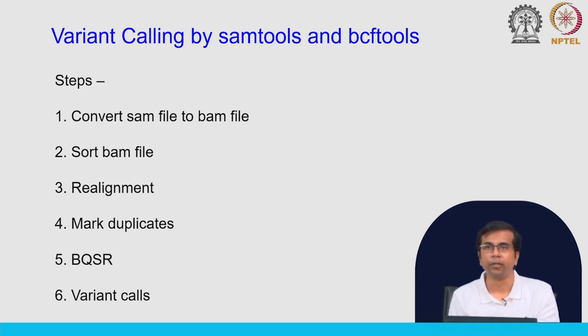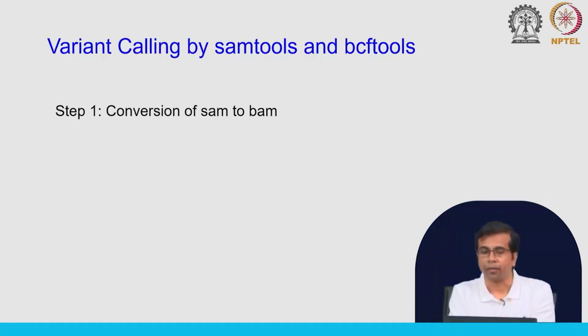Okay. So, one of the things you should notice is that when we install SAM tools, etc., you might end up with some issues with some libraries. Okay. So, you would have to install them independently. Okay. For installing SAM tools and BCF tools, you have to again rely on their install commands that are there. So, I can go and show you these install files that actually mention step by step installation process. Okay. So, I will show that, and then we will start with the conversion of SAM to BAM.